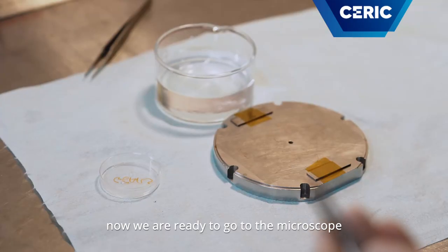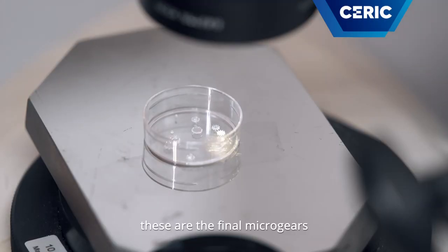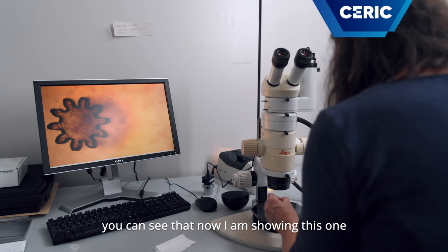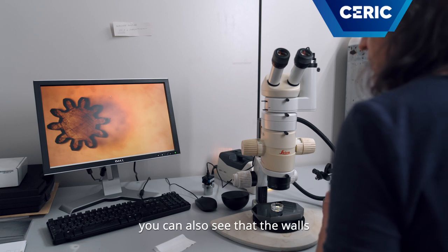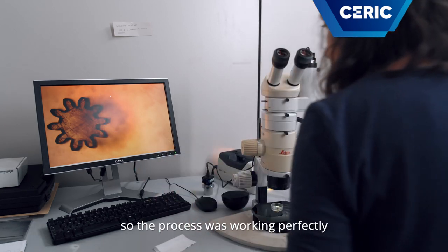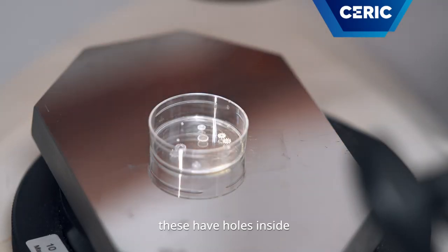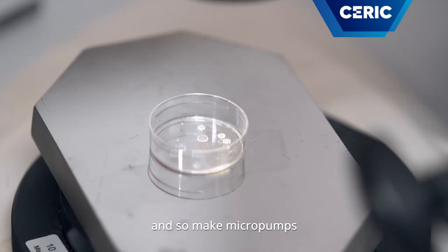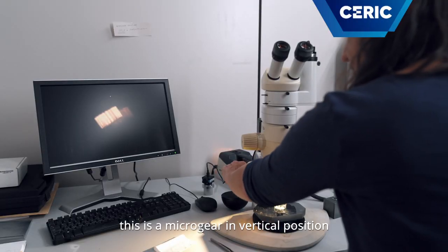Now we are ready to go to the microscope and see them. These are the final microgears. You can see that this one has one millimeter of diameter. You can also see that the walls are very precise and very straight, so the process was working perfectly. These have holes inside, so you can put a magnet in and make micropumps. This is a microgear in the vertical position.